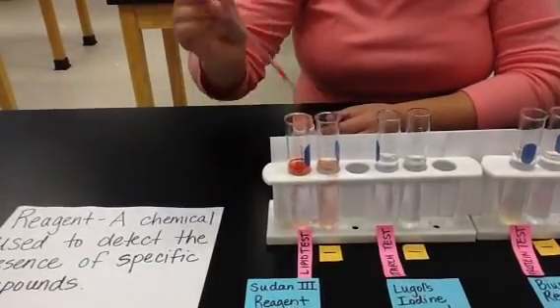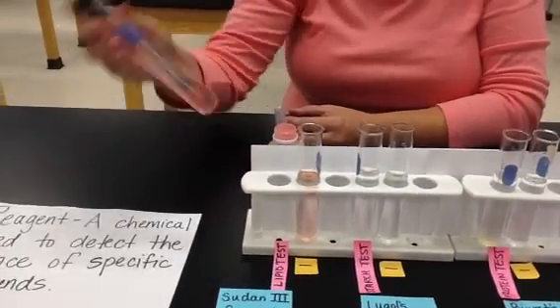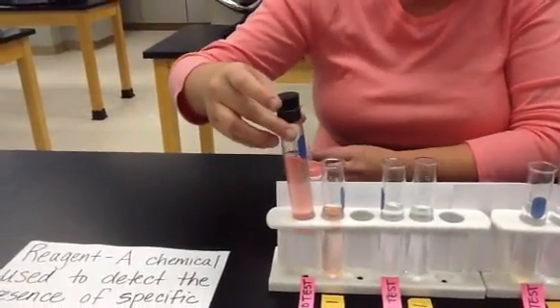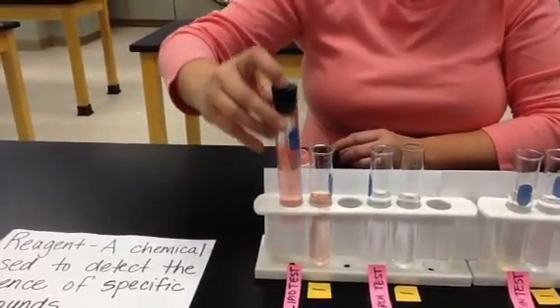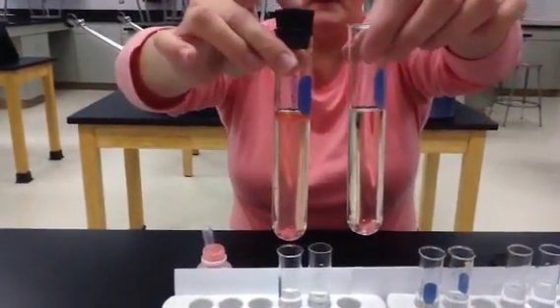So, just going to put some in there. And again, I'm going to mix it up and see what we get. We're going to come back to that one because we do need to let it settle for a moment. But you can already start seeing that it's starting to separate there. Looking at the difference between those two.